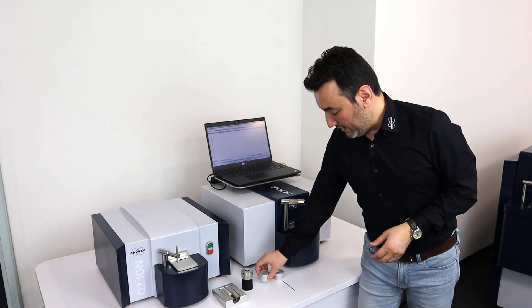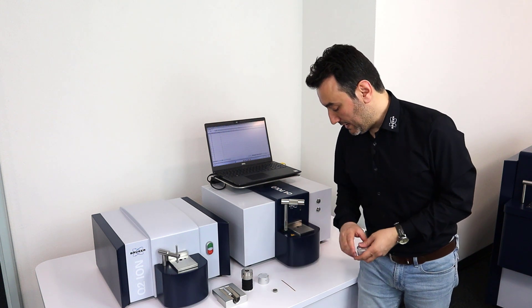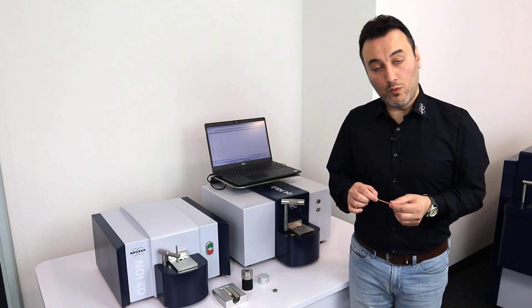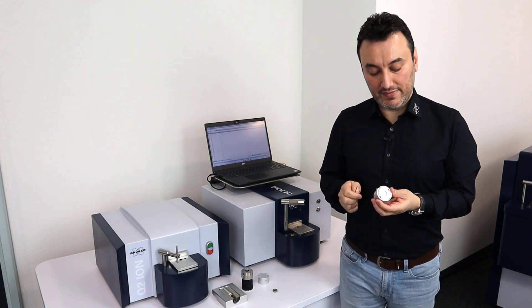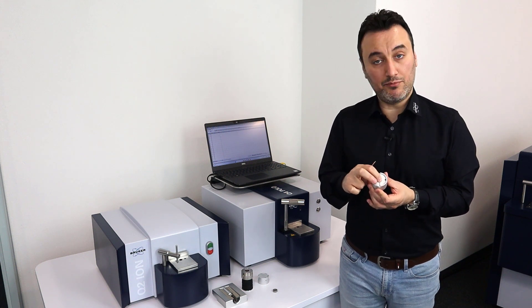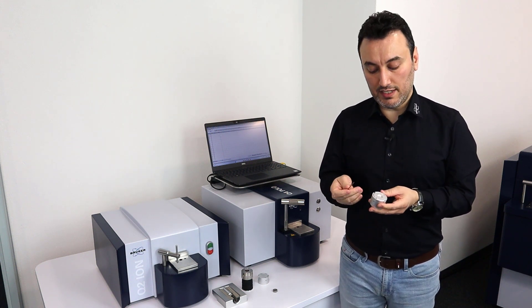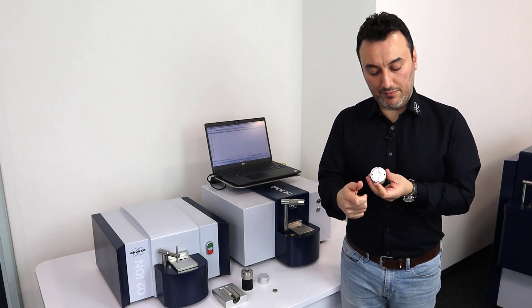The fourth adapter is another wire adapter, with which we can analyze a wire with 1 to 5 millimeters of diameter, like this copper wire here. It also has a spring inside to apply pressure on the sample during the analysis, and it has a groove right in the middle of the sample adapter.